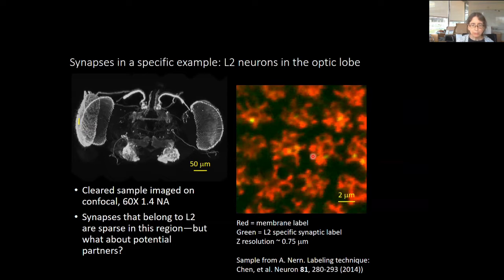The essence of the measurement we want to do is to selectively label another potential postsynaptic partner to this cell in this tissue, like this fictional blue blob that I'm adding, and see if it co-localizes with the synapses that we've labeled. Then we want to ask the question, does that co-localization of those labels imply that those are synaptically connected? That's a question about what else could be in our voxel along with the two things that we labeled that might actually be the postsynaptic partners. So that's a straightforward question about the resolution of your imaging.